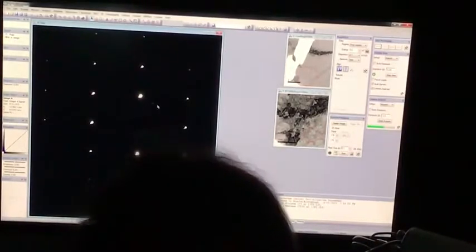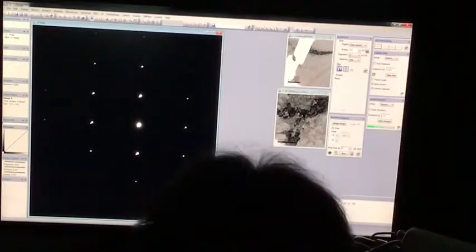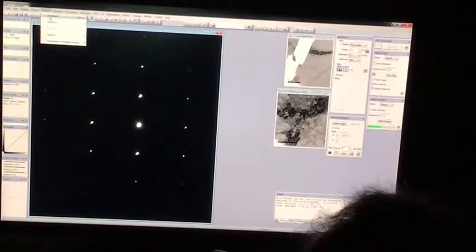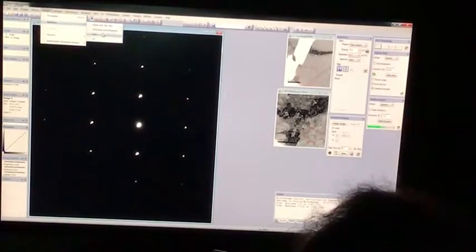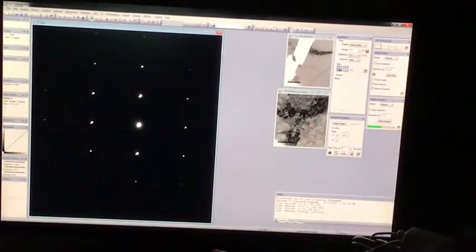Okay, so you can see there's quite a bit of saturation here. I think we are overloaded. No, not too bad, not too bad. I might even risk taking the beam stop out. Okay, so that's the diffraction pattern. We need to analyze how many counts are going in there. Statistics, minimum and maximum, 71,610 counts. That's just way too much.